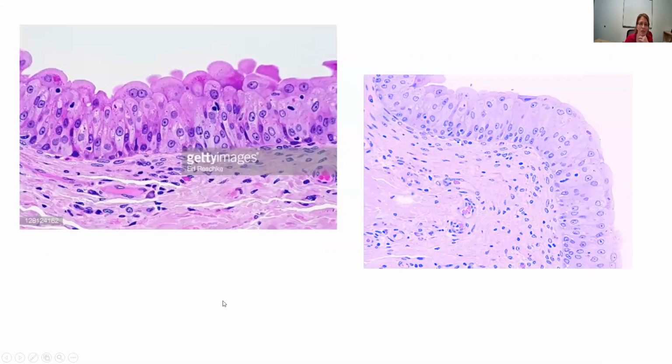All right, next one. Okay, so this one, I start out and I look at it, and to be really honest, on this particular one on the left, this cell right here tells me exactly what this tissue is. This is the only cell I even have to look at, but I'm gonna walk you through everything so that you're there. Oh, look, there's a similar cell right here. All right, first thing, what's my major tissue type? Well, I have an edge, so it's epithelium. Look, both of them have edges. Yay, epithelium. Easy to figure out the major tissue type on these. There's an edge, it's epithelium.